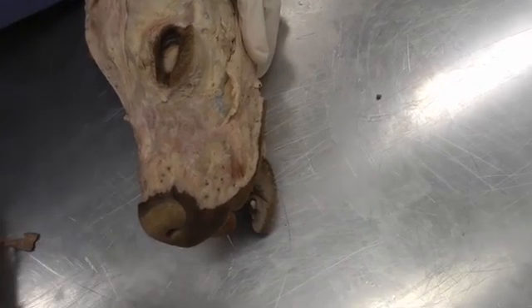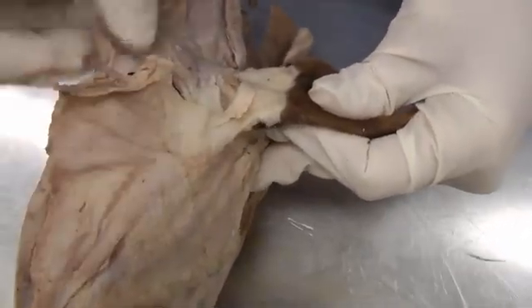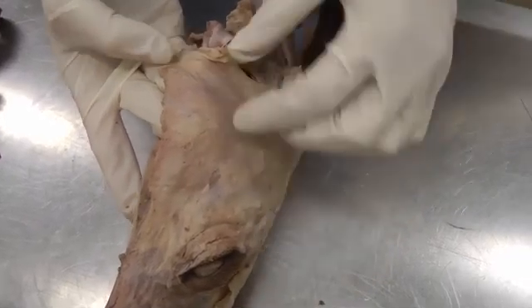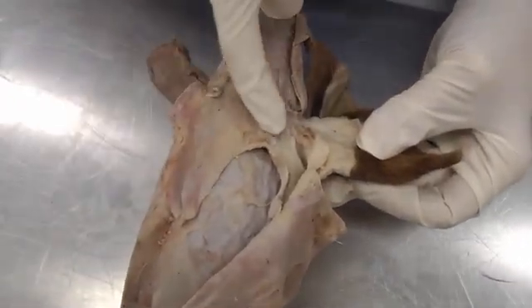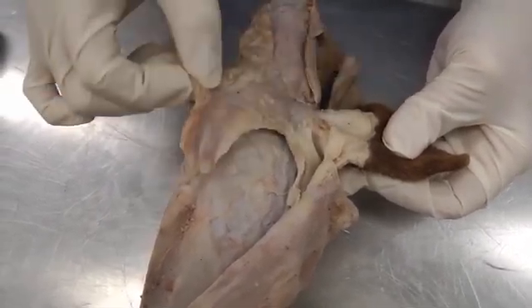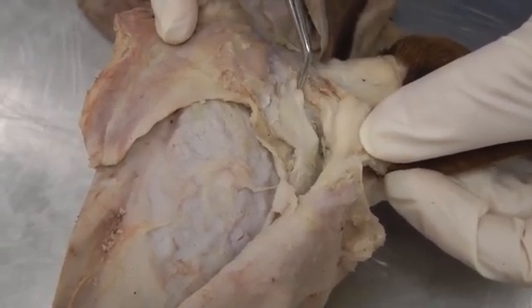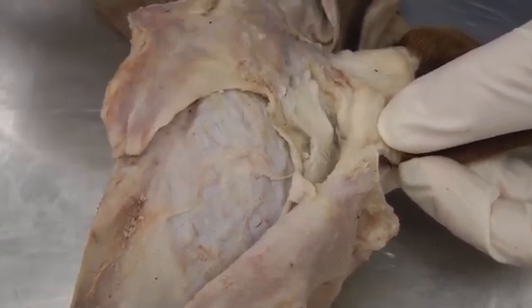Now we'll move on to some auricular muscles — ear muscles. These are the rostral auricular muscles: connecting to the ear towards the nose. Reflect those towards the ear. Then you have the caudal auricular muscles attaching caudally on the ear — just lift and reflect those as well. This whitish-yellow spot is actually a cartilage — the scutiform cartilage, kind of a boot shape. If you can find it in those muscles, just uncover it a little bit.